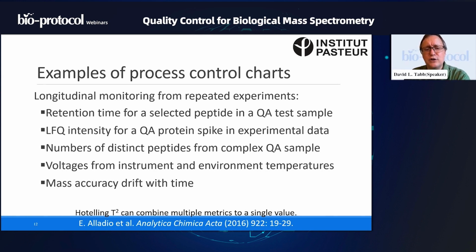What if we were trying to do quantitative proteomics? In a case like that, we might focus on the label-free quantitation intensity that we had from a particular protein spiked into experimental samples. So maybe our samples are trying to teach us something about Mycobacterium tuberculosis guts, but we've spiked E. coli protein in there in order to make sure that we know exactly where the retention times are placed, and to be able to characterize that the quantity is not changing as a characteristic between these samples.